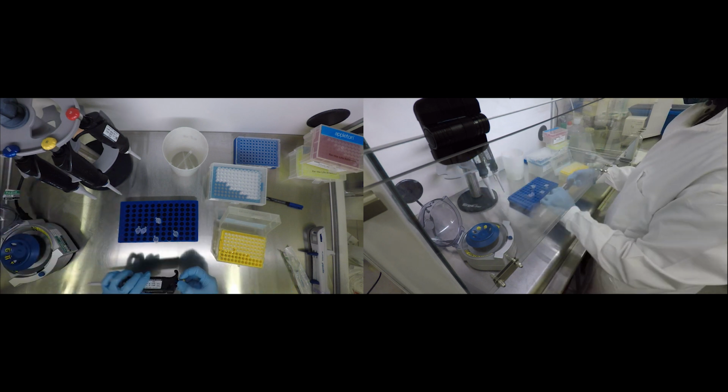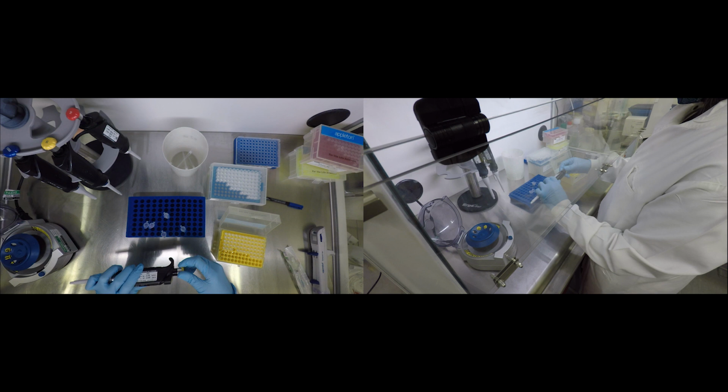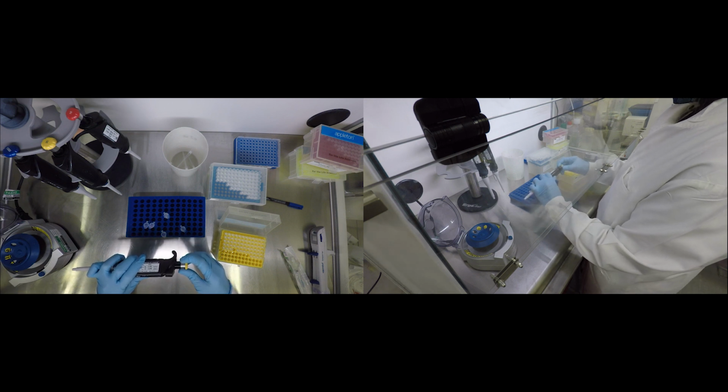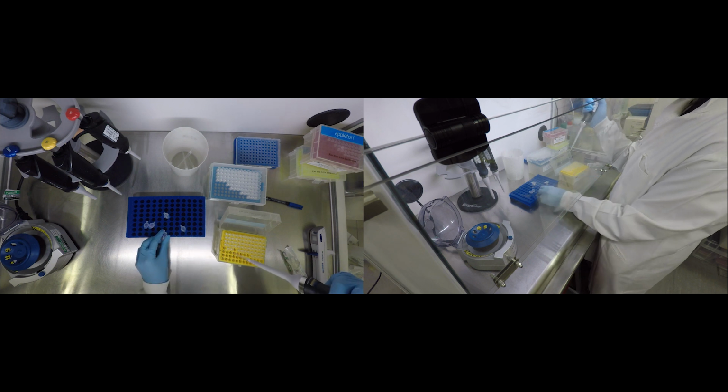Follow the recipes in the qPCR SOP or published work to work out the volumes required for each reagent, as the primer's concentrations needed per STH are slightly different.